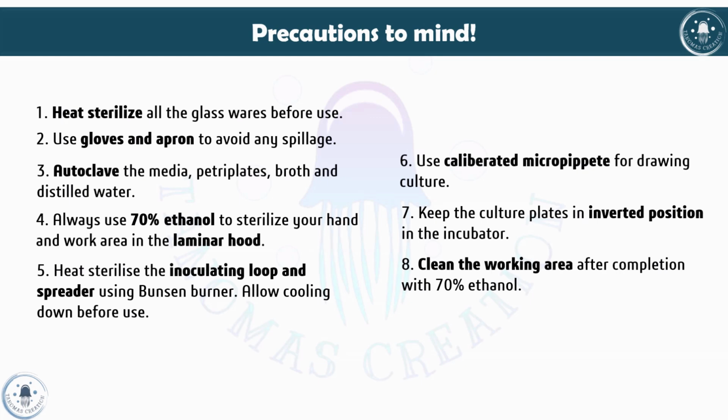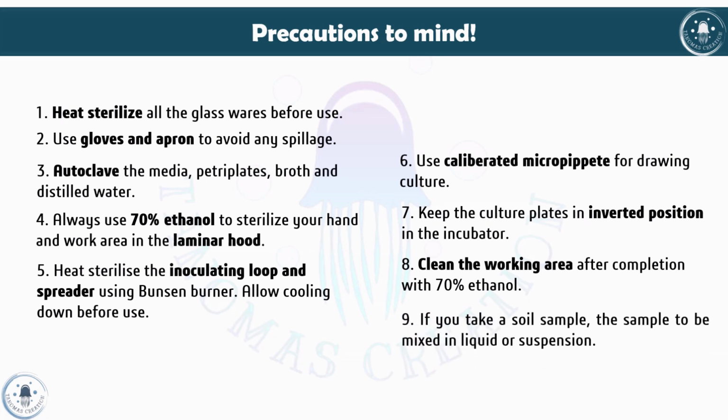And you need to clean the working area after completion with 70% ethanol. Clean your working area with 70% ethanol after you have finished all your work. Now, the most important one, the ninth one: if you take a soil sample, please remember the sample should be mixed in a liquid or made into a liquid suspension. Only a liquid sample can be used for this spread plate technique.